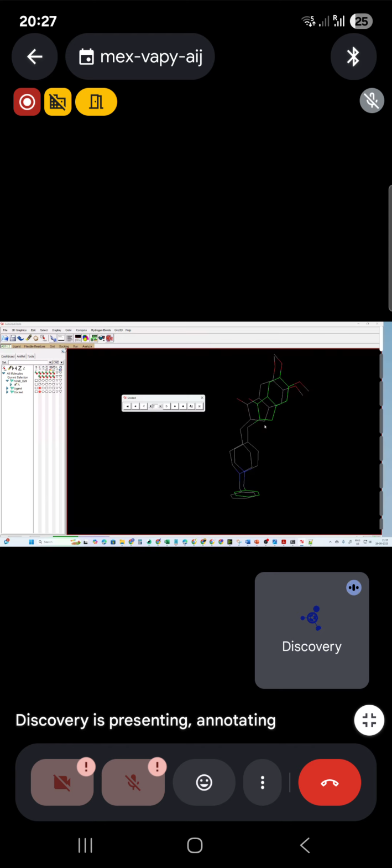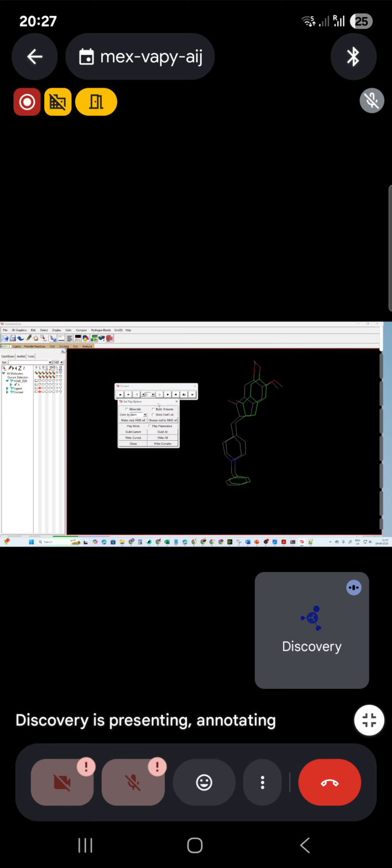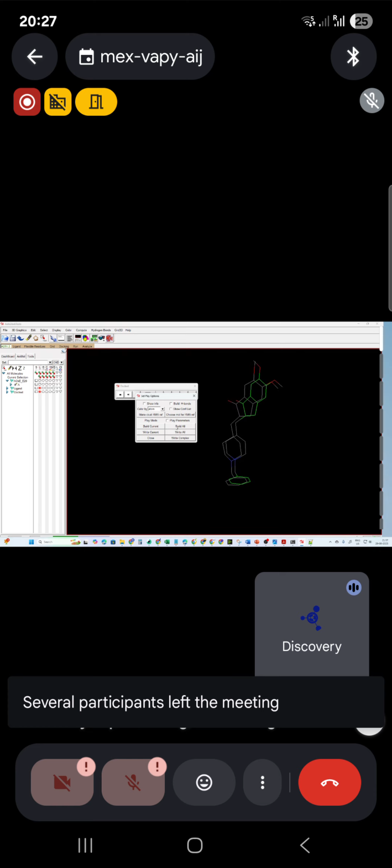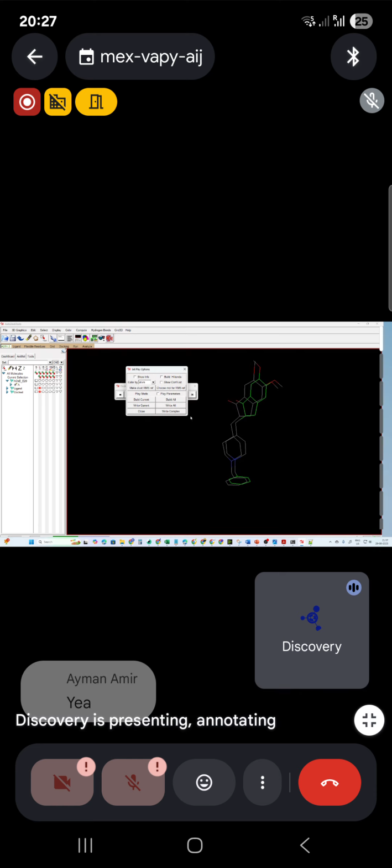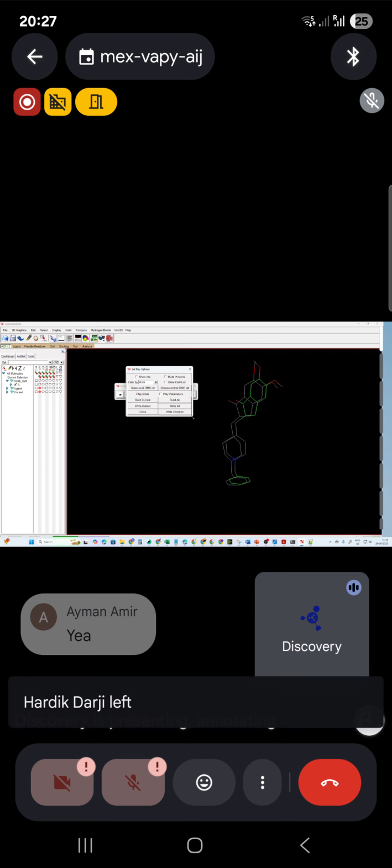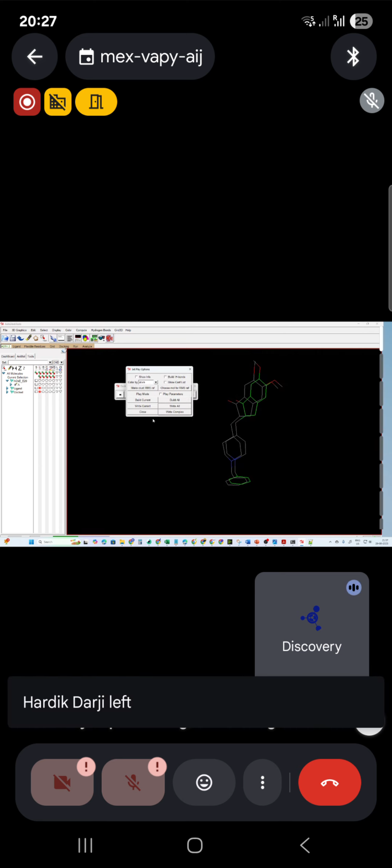Right. So let's extract this pose and calculate the RMSD value. To extract this pose, we have to go to this ampersand button here. There are many options to play around with, so learn or play around in your own time. We won't be able to do it here. So just click here.